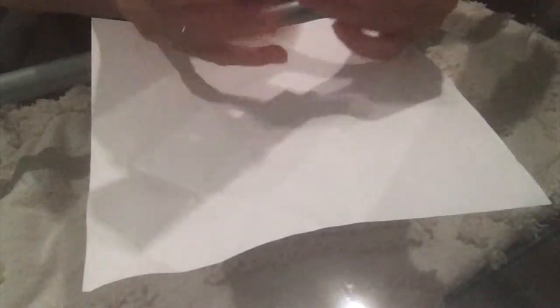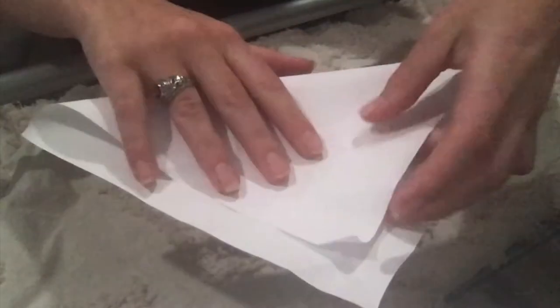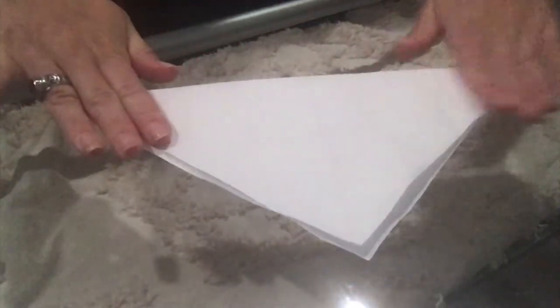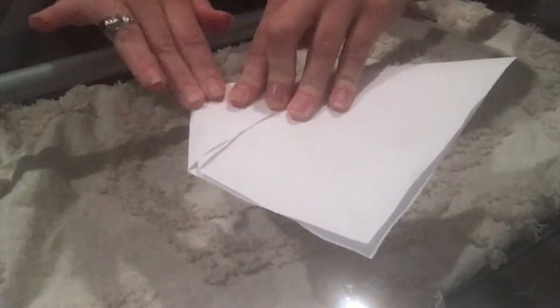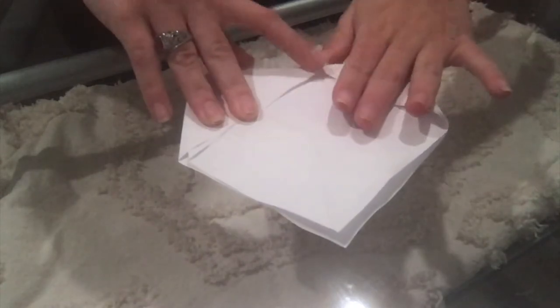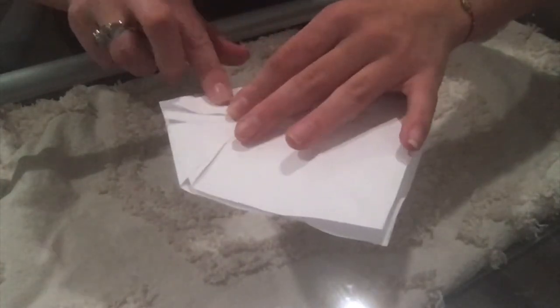Now we're going to repeat the same process. Place the paper in the center facing you and grab the bottom towards the corner, fold one side with the corner into the center. Note that my paper isn't a perfect square, but it's similar — if you're practicing with regular printer paper, make sure to cut it into a square first.